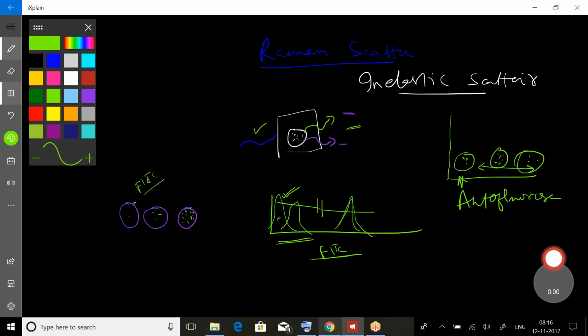So here we get scattering and we get fluorescence, and to put it in simple words, in flow cytometry, if we want to measure a parameter by using fluorochromes or fluorescence, we either use molecules conjugated to fluorochromes, or we use fluorochromes that bind to the cell and give certain functional information.